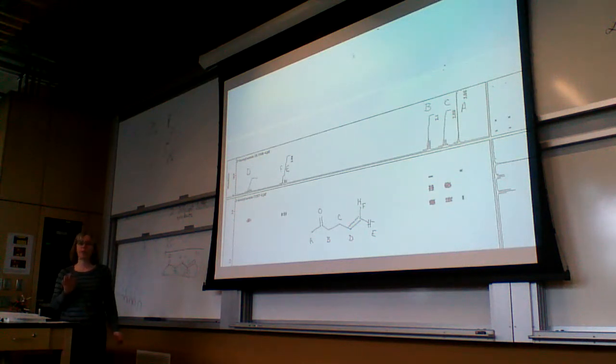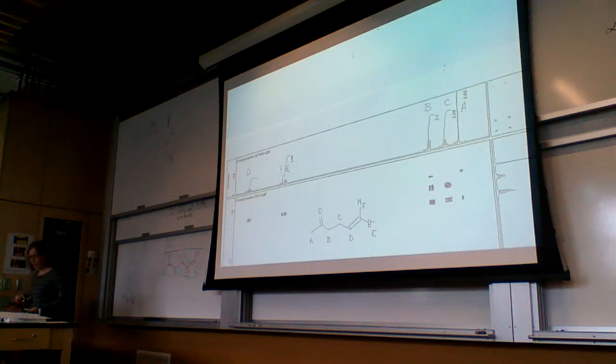So we're getting pretty good at that. The correlation spectroscopy with the 2D is going to help us assign those a little bit better. But I did want to talk about the NOE before we go on to that, so we'll come back to this. I needed my molecule to talk about NOE.